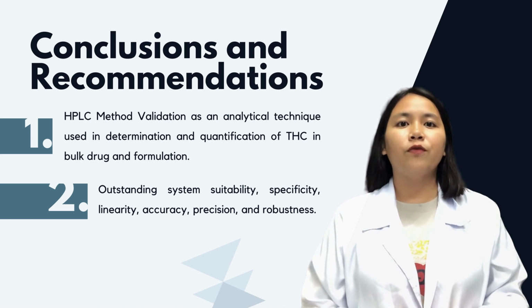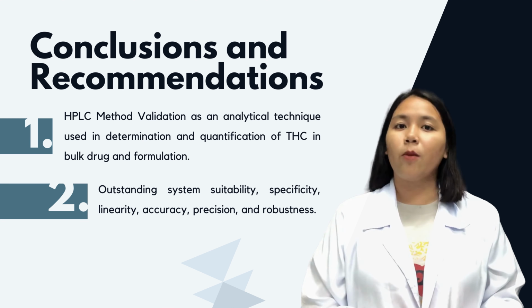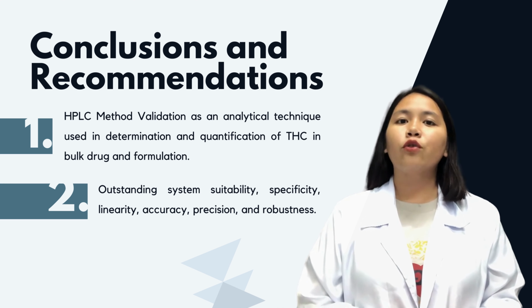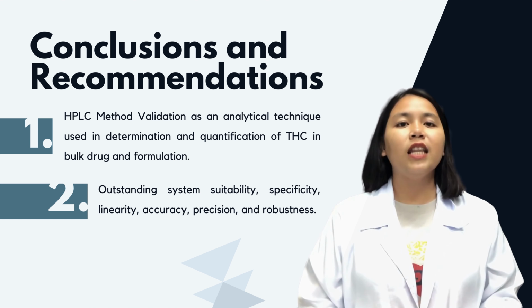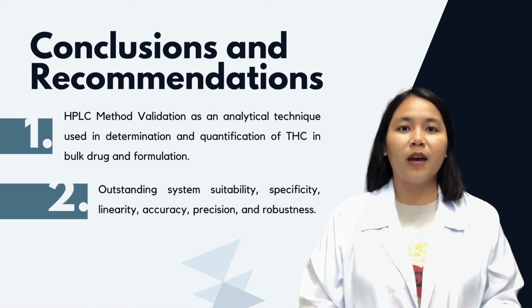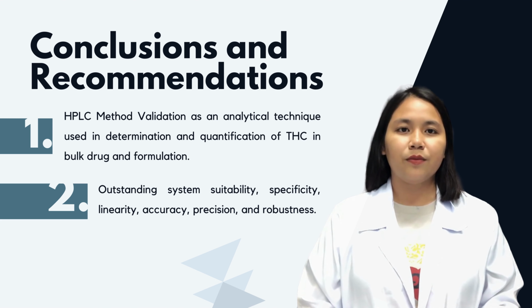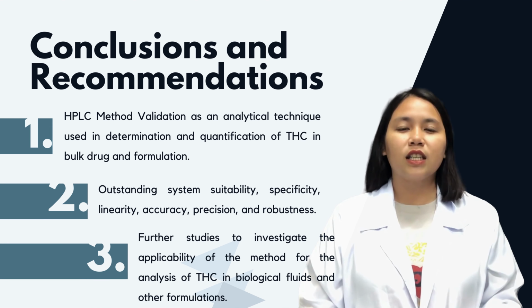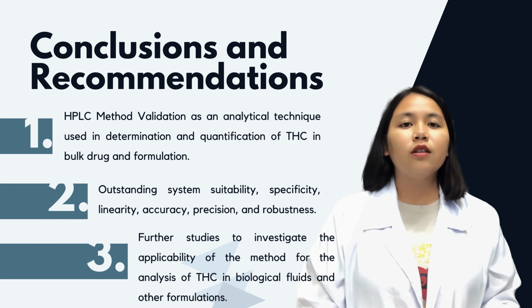As all of the above points have demonstrated, this method is notably suitable and optimal for quantification and routine quality control analysis of THC, which is highly beneficial in the development of the medical and pharmaceutical research and manufacturing industries. Further studies can be conducted to investigate the applicability of the method for the analysis of tetrahydrocurcumin in biological fluids and other formulations.